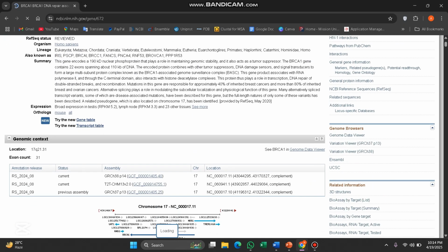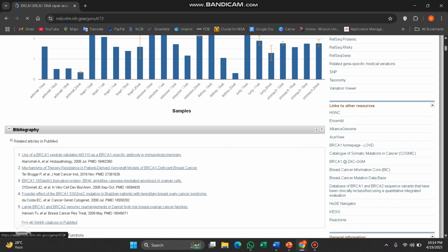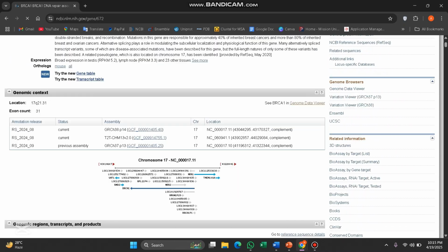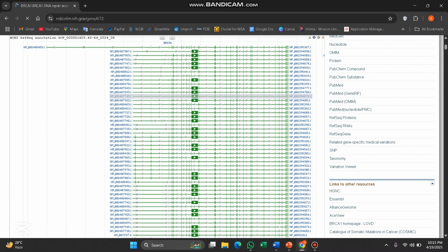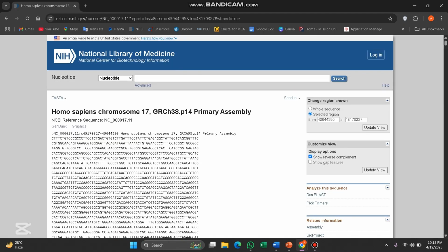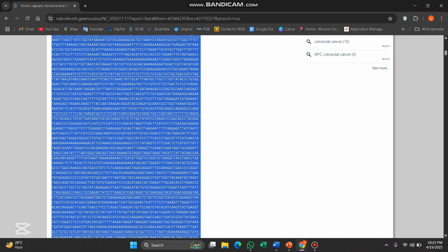And here we got a lot of things, but I'm just going to show you the FASTA sequence. Just click on FASTA, and we get the sequence of our BRCA gene.